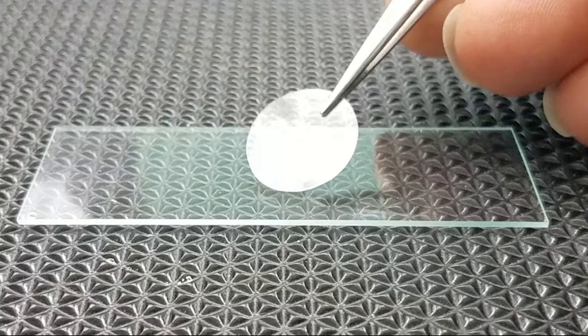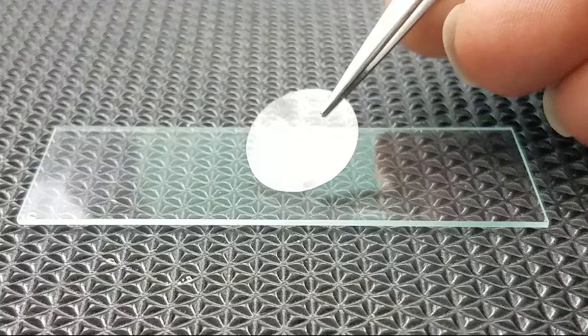Place a cover slip — a small square piece of plastic or glass — onto the root tip. Apply increasing pressure straight down over the cover slip, squashing the root tip. Observe your slide under high power, 40X.